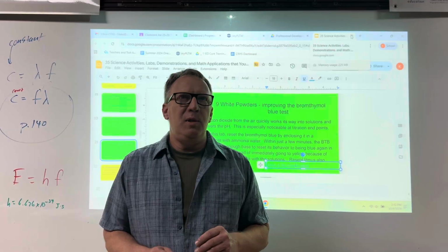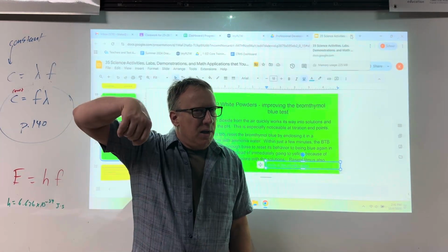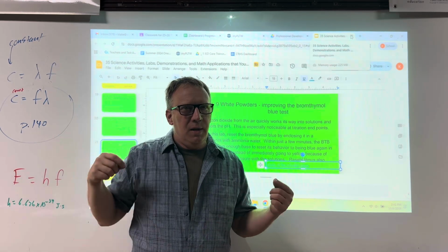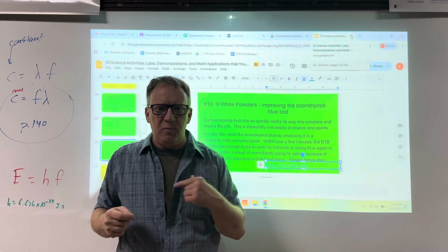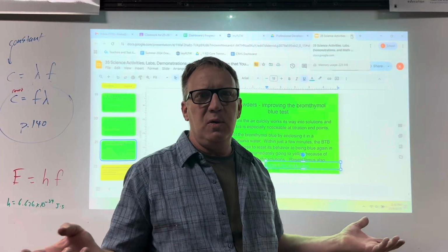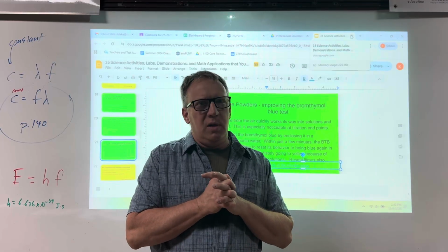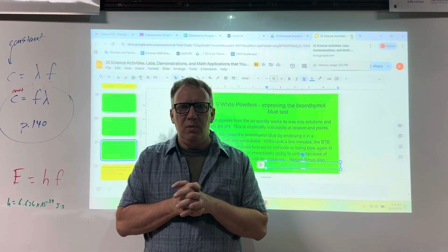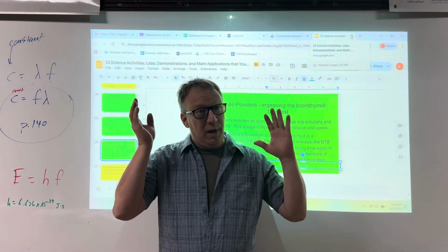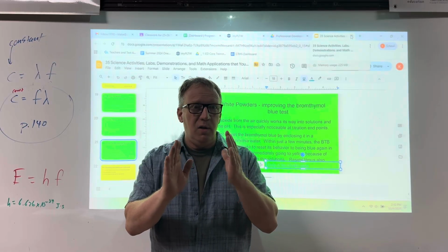There's been many times I've been using phenolphthalein and it's barely pink, and I'm sitting there swirling it and the pink goes away. That's because it's picking up carbon dioxide from the atmosphere. We don't realize this in our reactions. It doesn't make a difference most of the time. But let's say you're picking up a few 100 trillion carbon dioxide molecules a second. That's nothing. That's a blip on the radar. But it's enough to push an indicator to change color if it's at the endpoint.